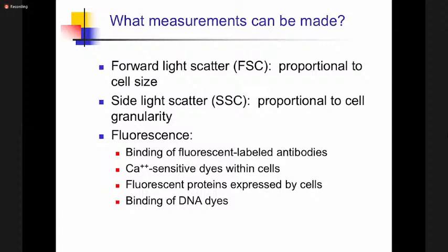And these leukocytes, the white blood cells, would have markers on their surface. So if you talk about, for instance, leukemia, which has got predominant expression, B-cell leukemia or T-cell leukemia. If I'm talking about B-cell leukemia, then definitely I'll be looking at markers which are expressed on the surface of B-cell. If I'm looking at a T-cell leukemia, I'll be using that fluorescent T-labeled antibody to mark for me markers on the surface of the T-cell.